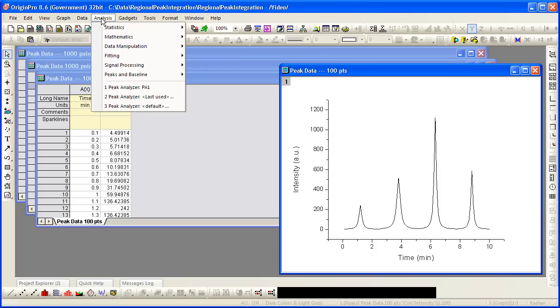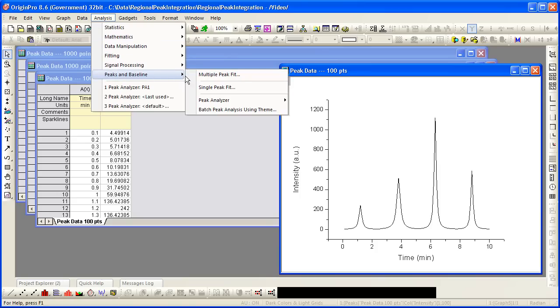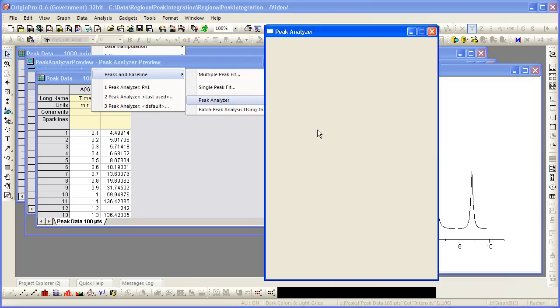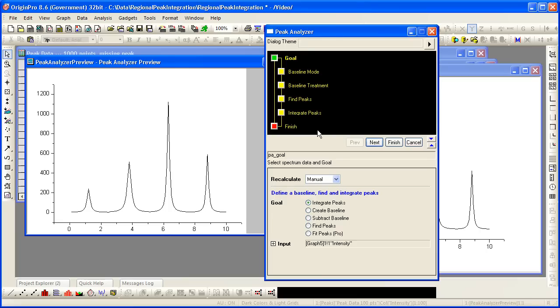I will go to the analysis menu, select peak and baseline, peak analyzer, and open the dialog to begin the analysis.